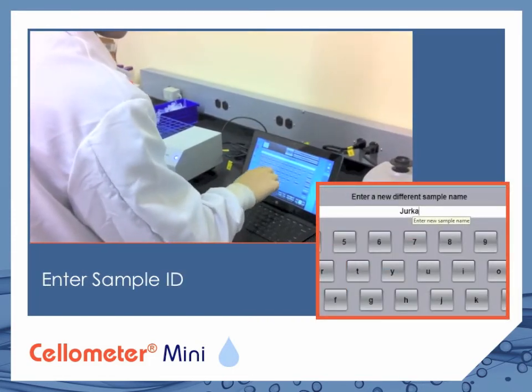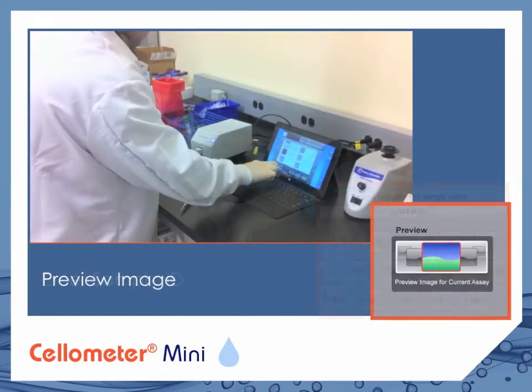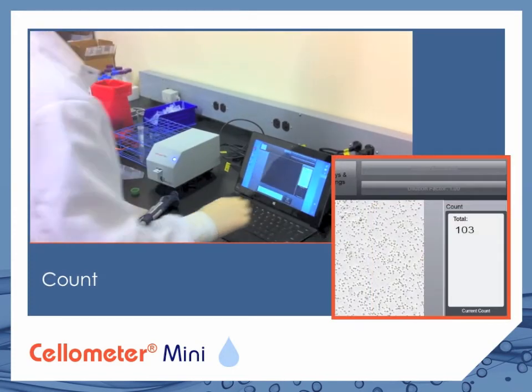Enter a unique sample ID and preview the cell image, adjusting focus if necessary. Select count.